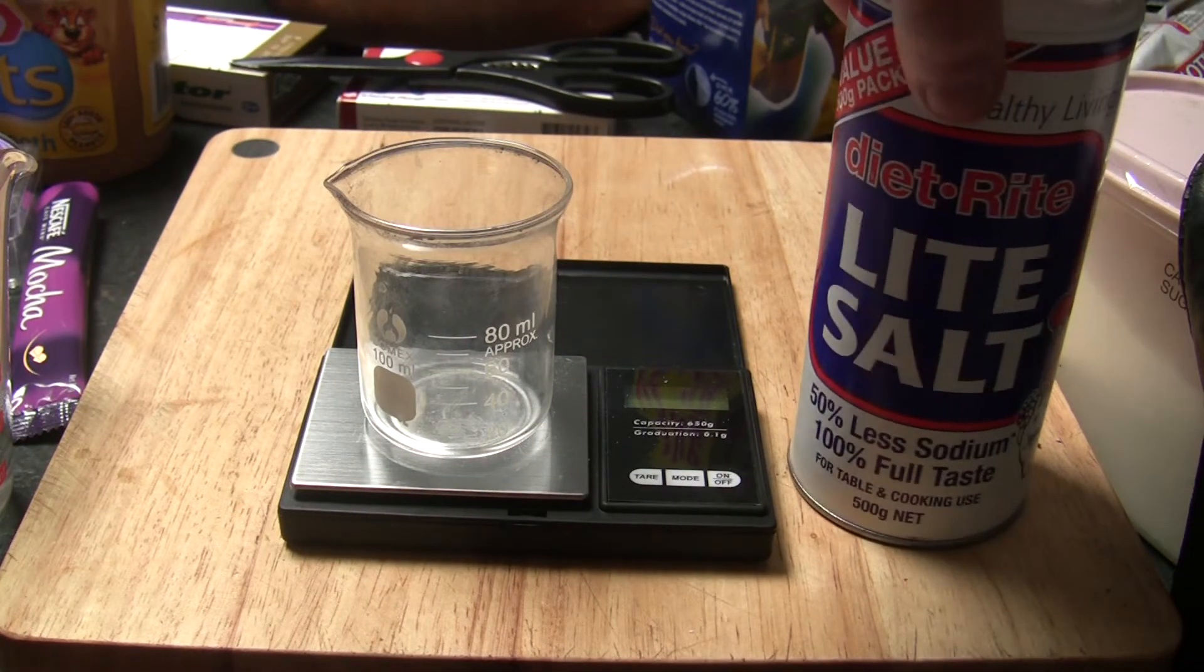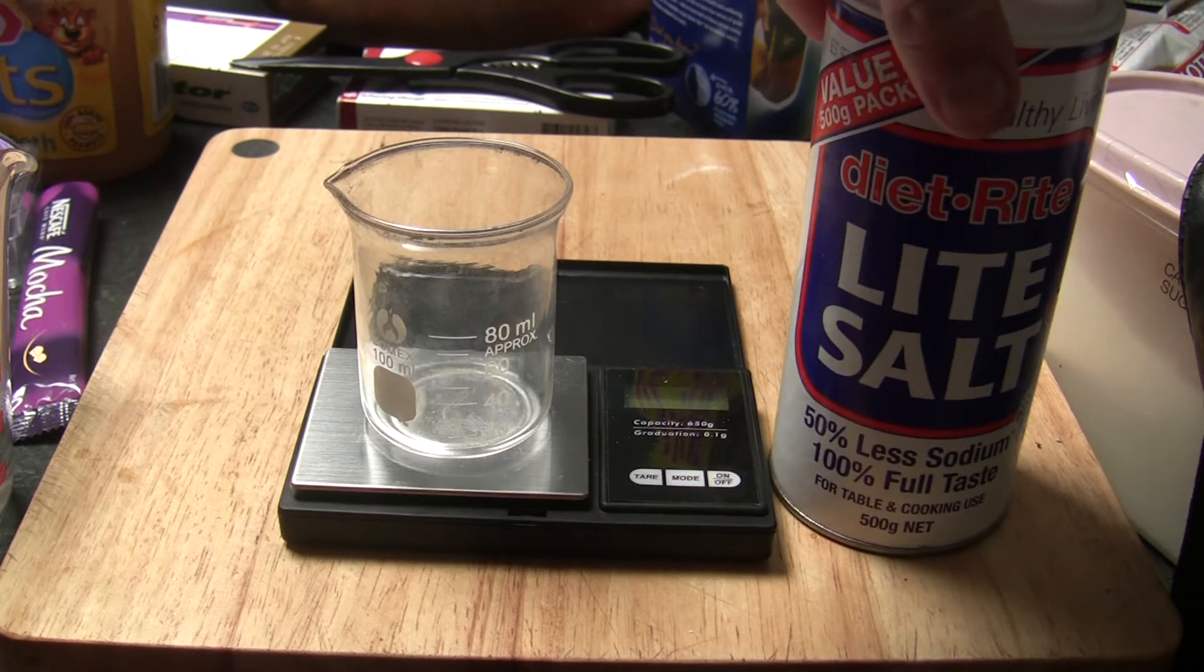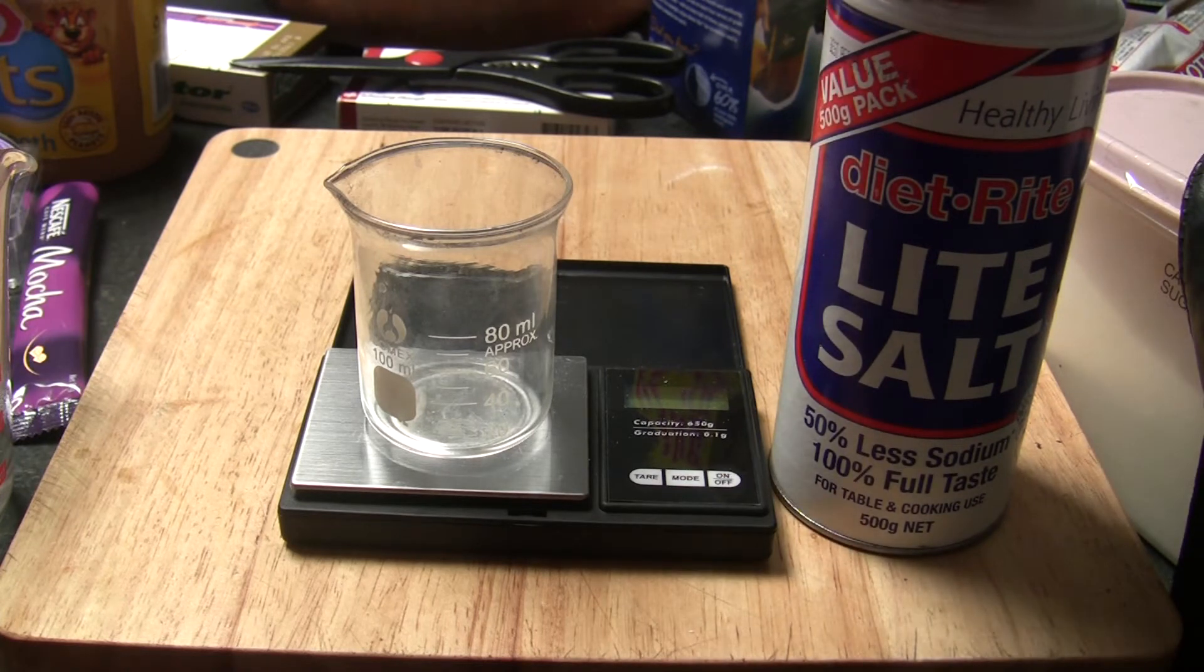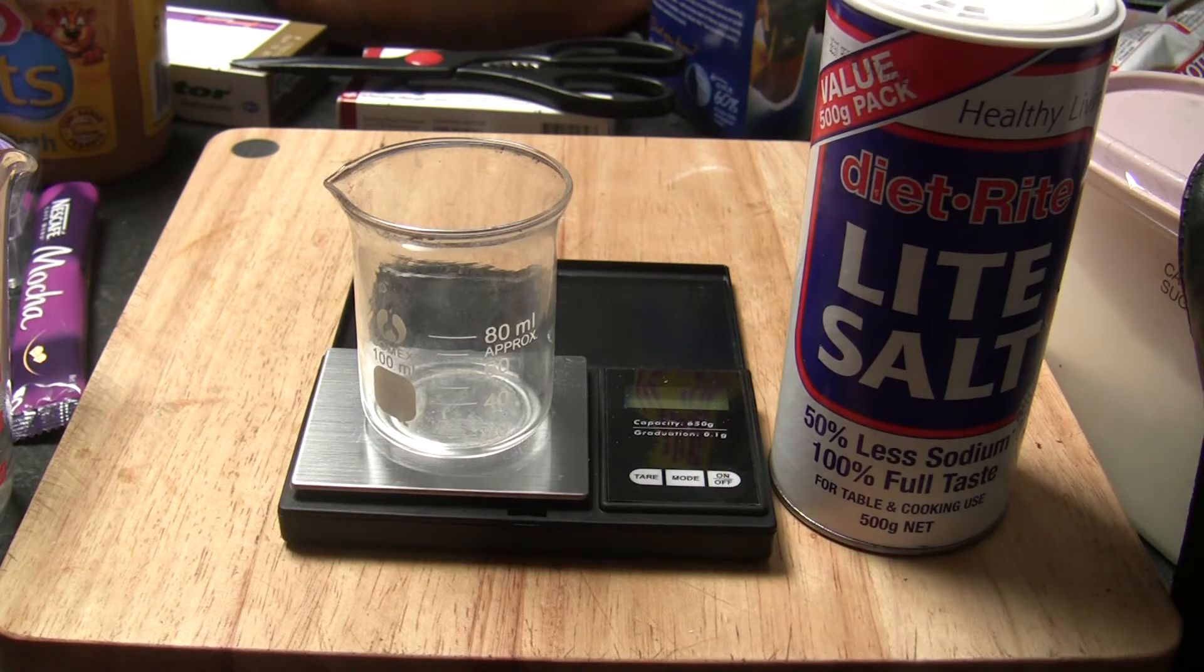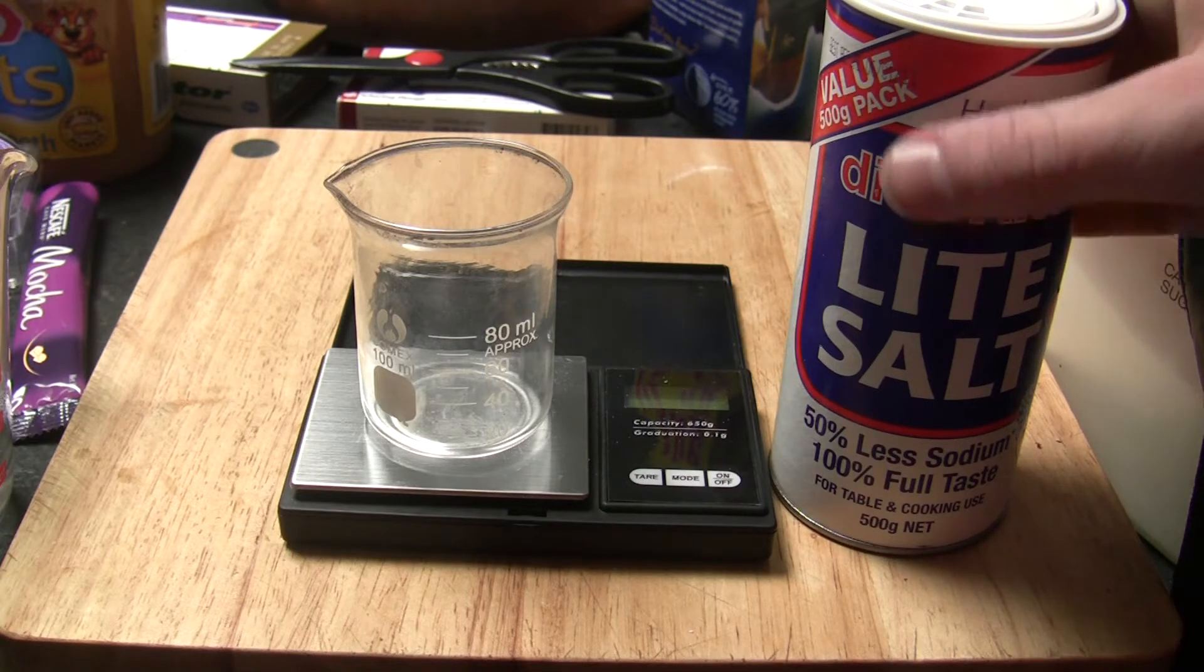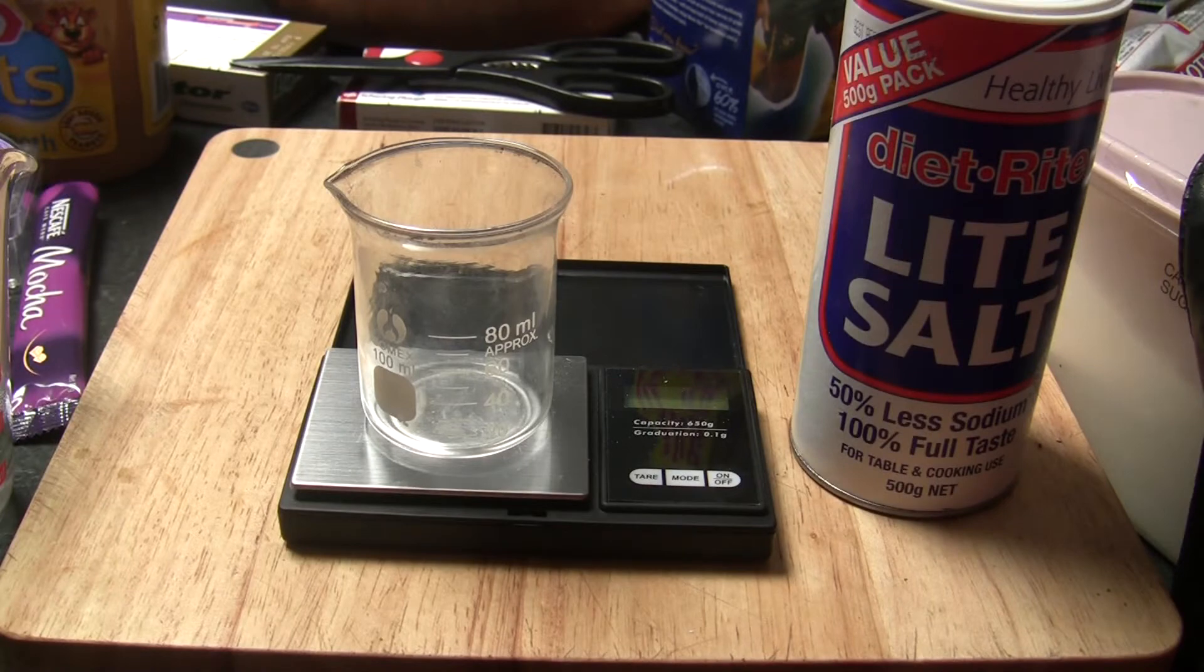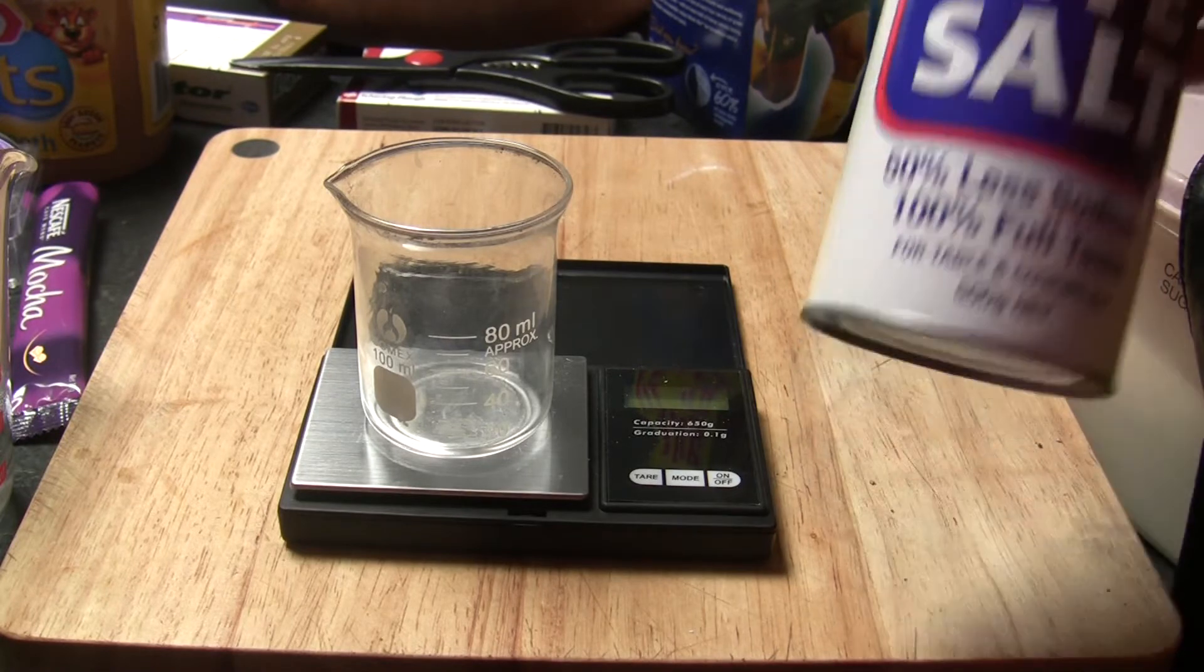You can normally buy 100% potassium chloride, but recently I've been having trouble trying to find it, so I'm just going to use light salt. This is an experiment exploring the different solubilities of the salt to extract potassium chloride from it.